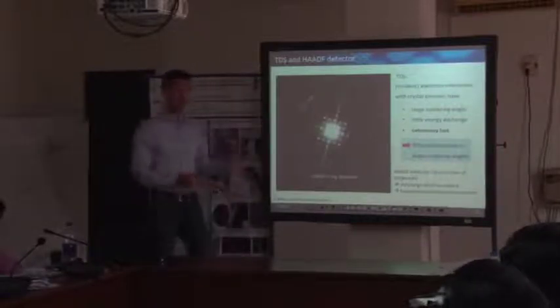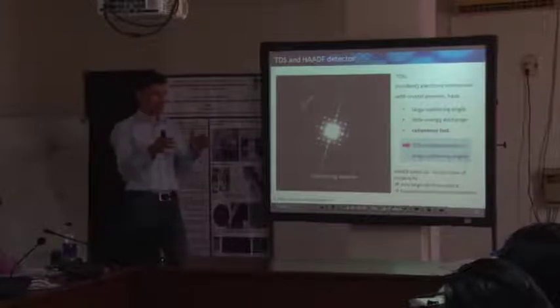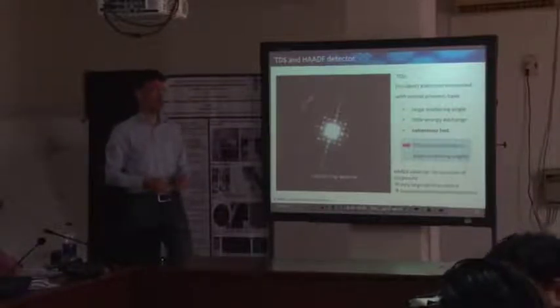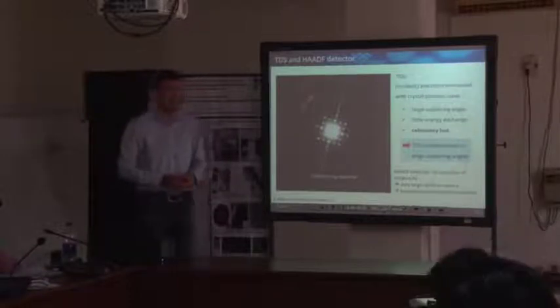If you go up to a very large camera length, so that your central disk just hits this active area, and you zoom in further, then you might cut off your direct beam. There are such applications already published, but in principle, most microscopes don't provide a very dedicated detector.